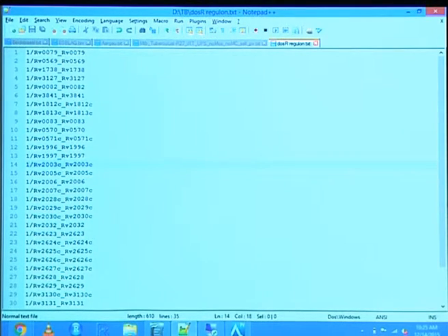Usually, in the case of human, there are UniProt identifiers. In the case of MTB, there are these Rv identifiers. These are the systematic names of the genes. They're named from 1, which is somewhere on the genome, and then 2, 3, and so forth. The C stands for complementary, so that's just the other strand. And then you can pretty much build your genome. That's why it's useful to have these.